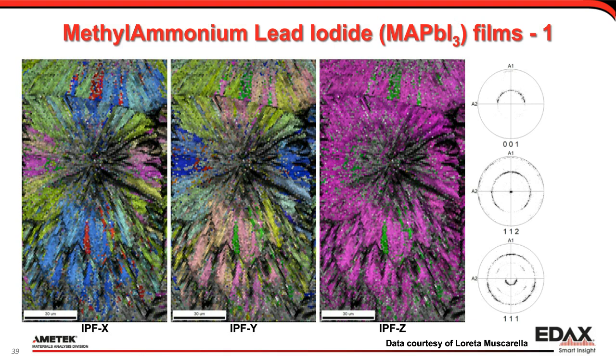And when I then look at the orientations, you can see that this corner point of the crystal sticks out everywhere where it's pink, but where it's green, that's the side. That's the 100 direction actually. And it's almost as if this is a perfect symmetric growth in this microstructure.